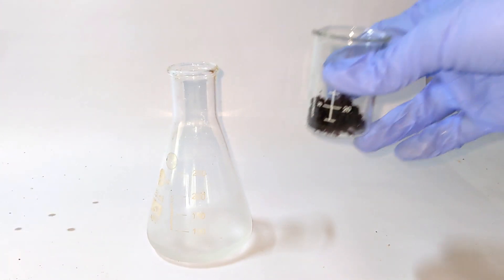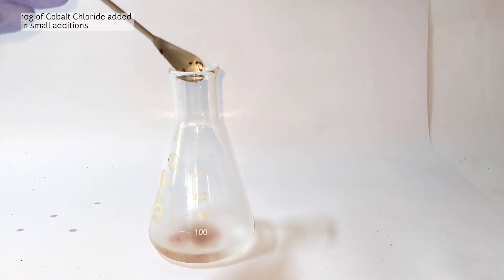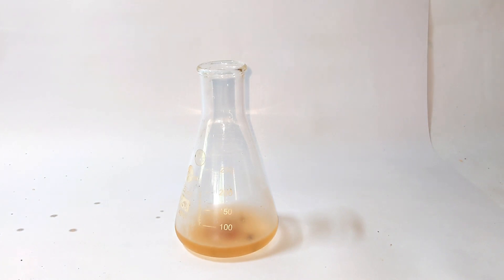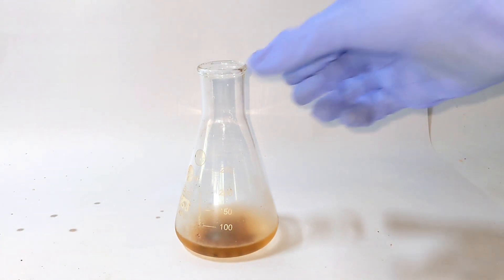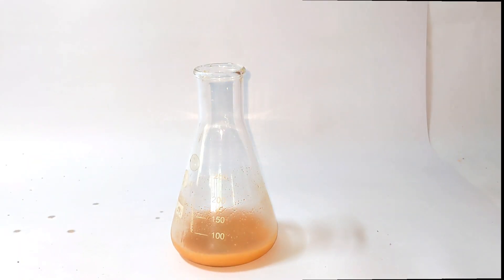Now 10 grams of pre-weighed cobalt-2 chloride was added to the flask in small additions at a time, with frequent shaking in between the additions. You will see the formation of a brown color which will soon result in the formation of a brown slurry after the complete addition of cobalt chloride.